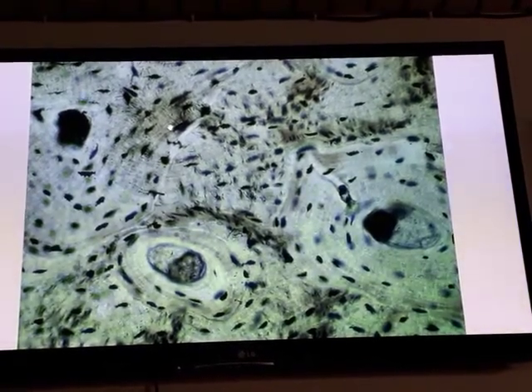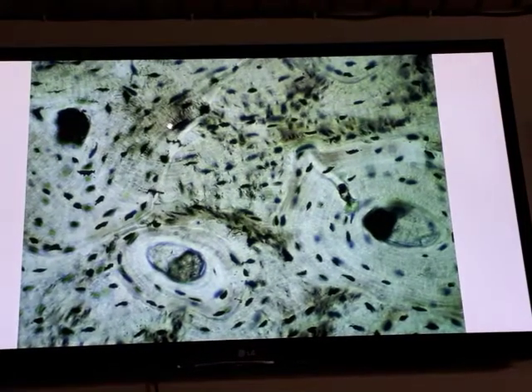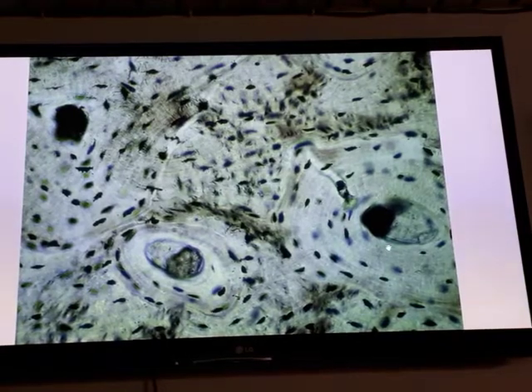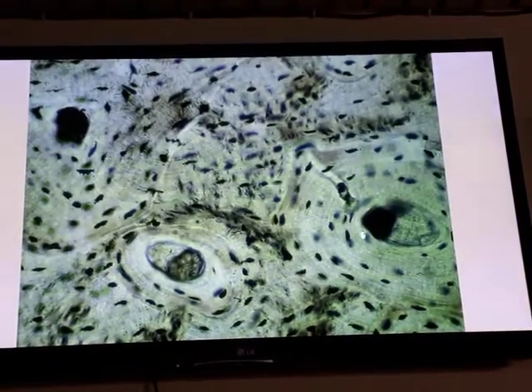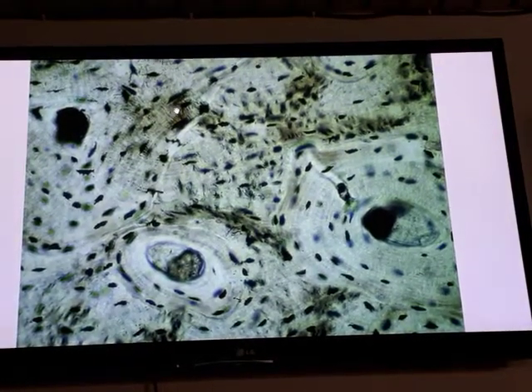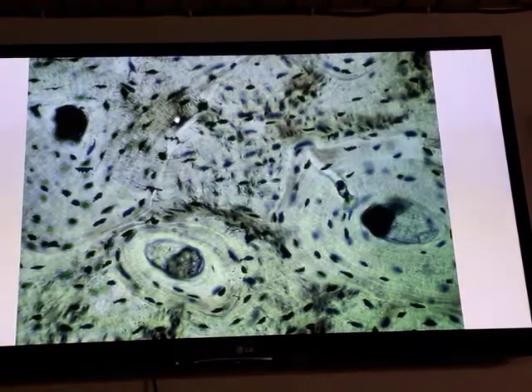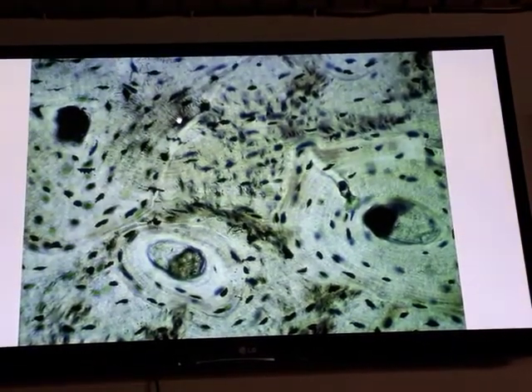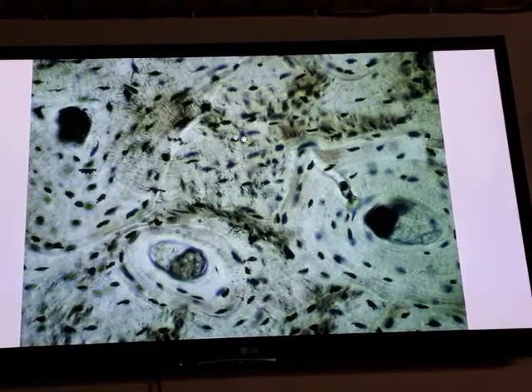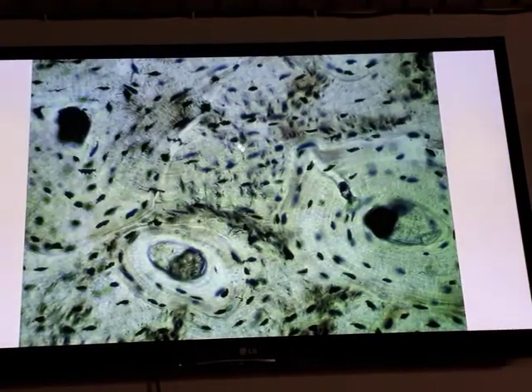This slide is stained with silver stain. Around the Haversian system or osteon, we have a central Haversian canal surrounded by laminae. These are osteocytes, and we have canaliculi as cylindrical spaces. On the outer and inner circumferential laminae, these are intermediate or interstitial laminae, appearing as irregular or triangular in shape.